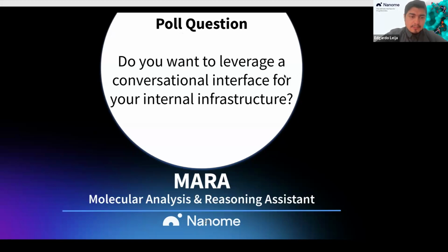So that was an example that was leveraged from an open source initiative, but the purpose of this platform is to make it as extensible as possible. So if there are other synthetic accessibility algorithms that you would prefer, as long as it has an API that you can hit, or a Python script that you want to integrate yourself, or any custom solutions out there, that's how you would access that.